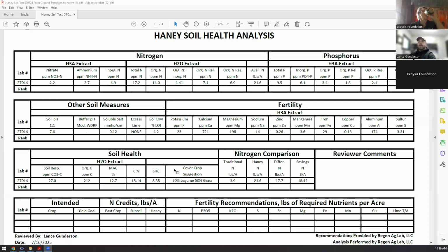If you are less than 100 parts per million, then you certainly don't need any more, but it's also not causing any big issues. It could if we're losing soil into nearby waterways. Of course, if you have a retention pond and you're getting phosphorus runoff into there, then yes, you can have some problems, right? But most likely the compost addition. I would say 99% that's what it's from.